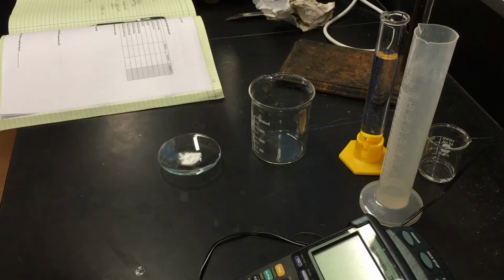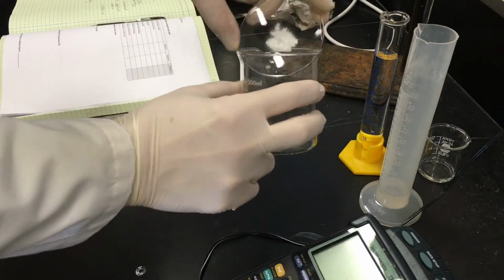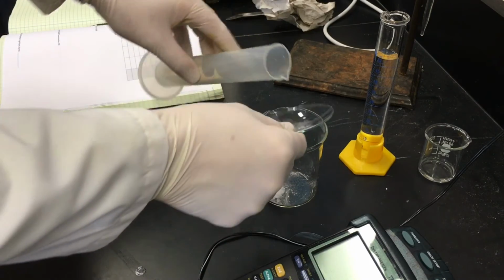So we're going to make our solution of aspirin, and we're going to take our sample of aspirin and mix it with 95% ethanol.